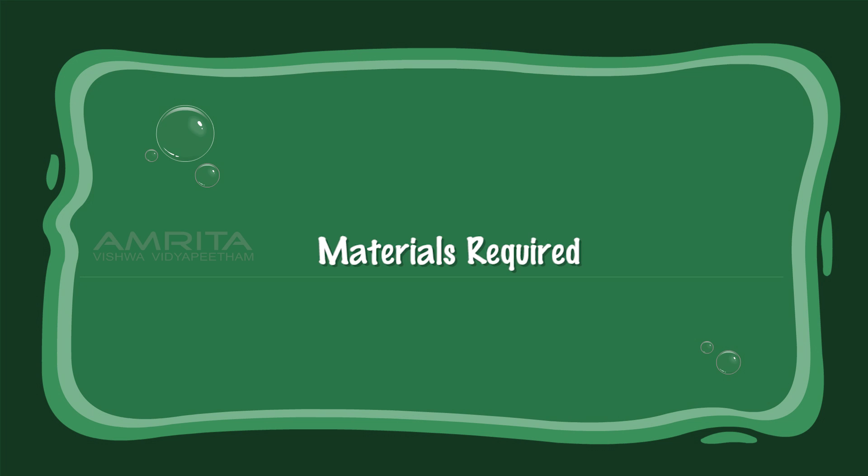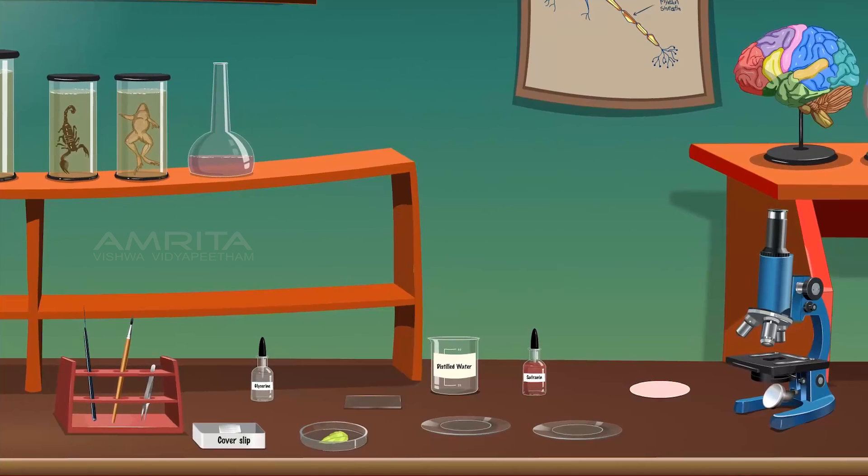To do the experiment we require: needle, brush, forceps, glycerine, cover slip, a fresh leaf of balsam, glass slide, watch glasses, distilled water, safranin solution, filter paper, and a compound microscope.